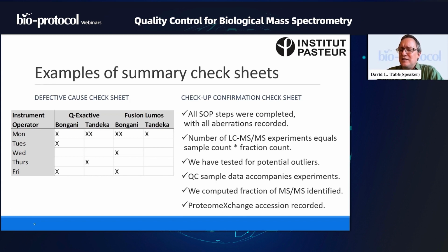Okay, so somebody sent us so many samples and they asked for us to use 10 fractions on each one. So I should be able to multiply the number of samples by the number of fractions to get the total number of LCMS-MS raw files that were produced. It may be, however, that I forgot one of those files. So it's a good thing to go back and check that the number of files in the manifest equals the number of files that you are transferring to them.